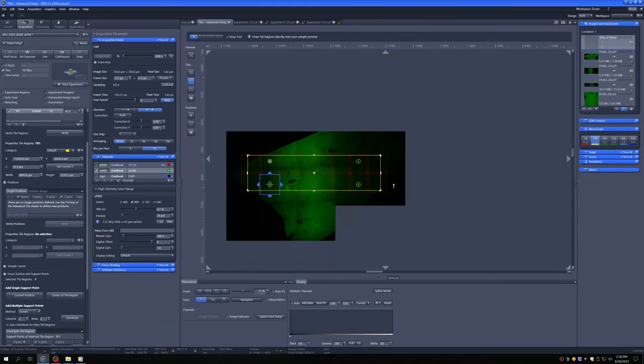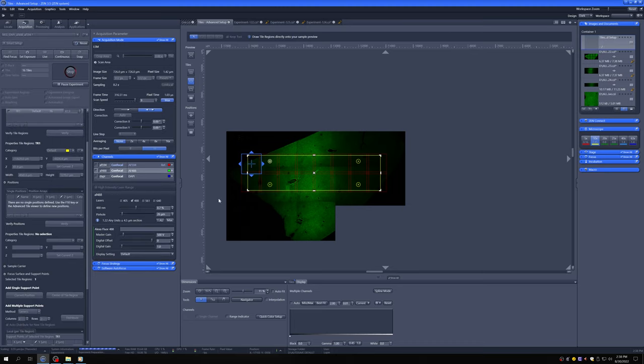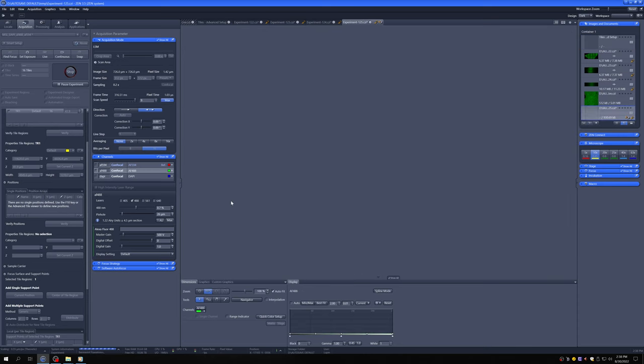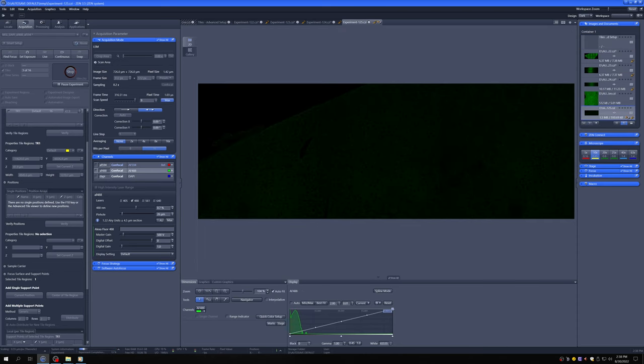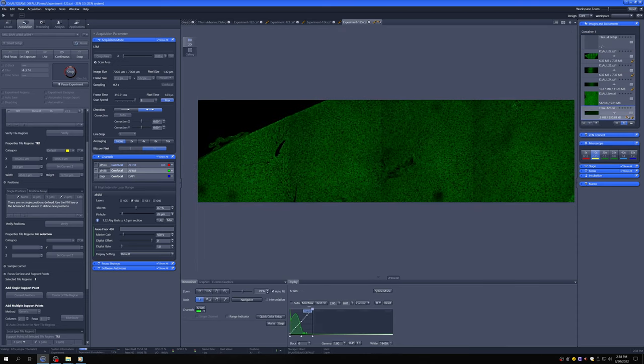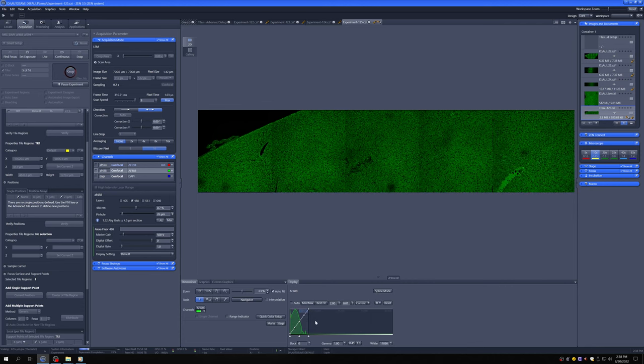So now if we say start experiment, it'll do the same tile, but it'll compensate for the Z position as it goes along. And you can see that now everything is nicely in focus.